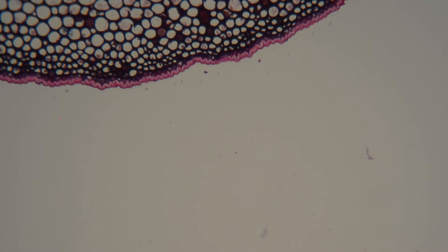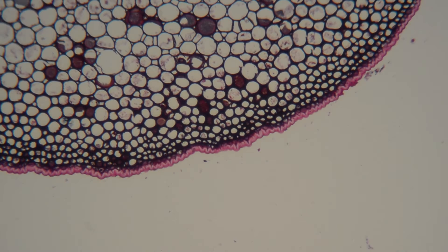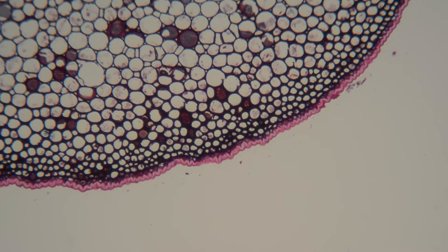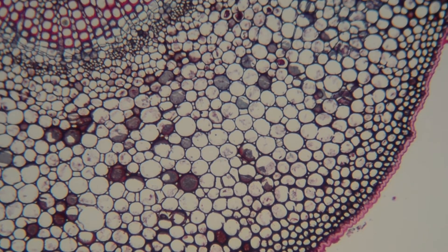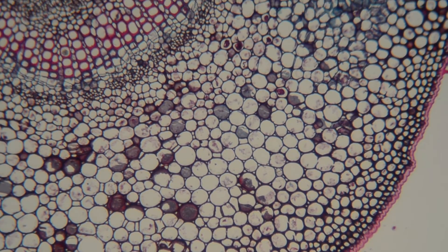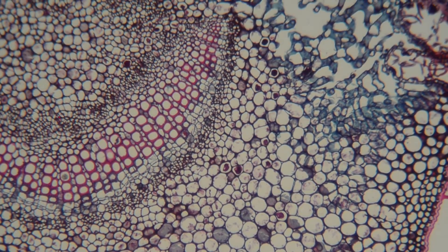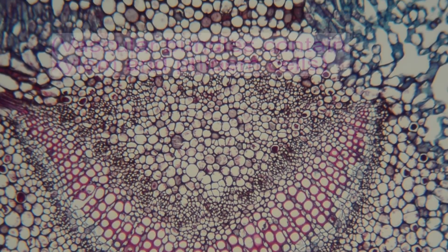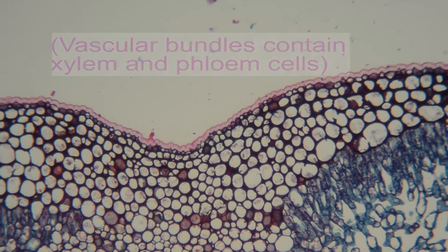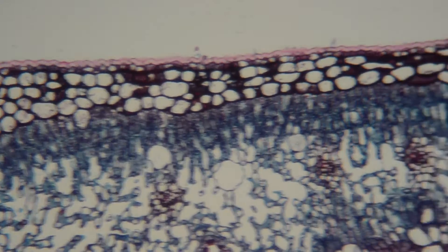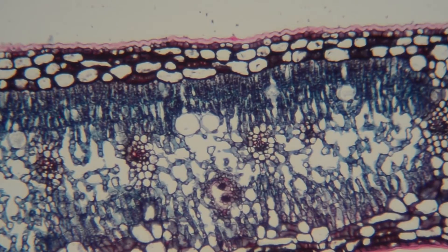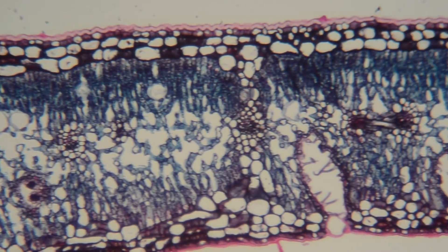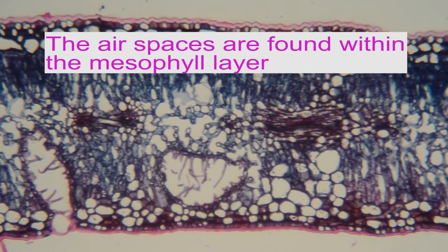We're now at 100 times zoom, and we can see in pink the epidermis cells of this leaf, along with all these storage cells and a vascular bundle. There's also a lot of space in here as we go along this leaf.